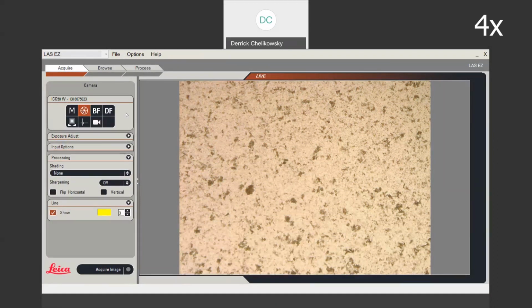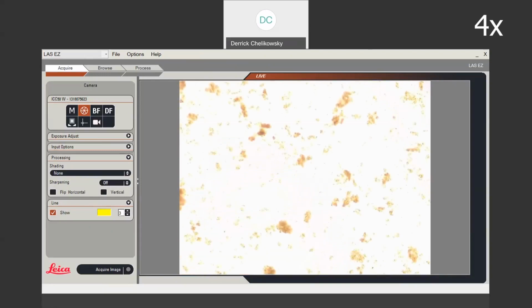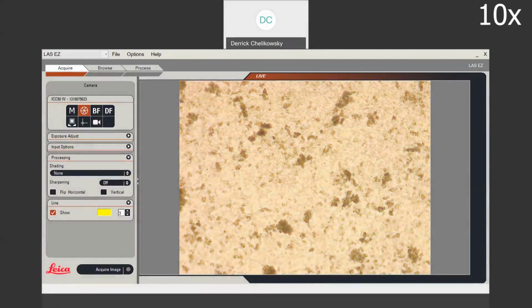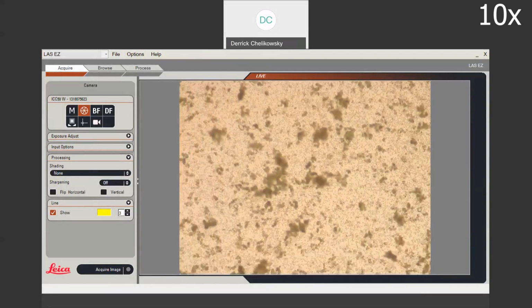What we're going to do next is I'm adjusting the settings on the video through the LAS system, and we're going to be moving, here we go, into our next magnification. And as you can see, magnification is now 10 times. The cells are slightly bigger. The goal of this section is to look at two very important things. The first is the shape and size of a yeast cell.